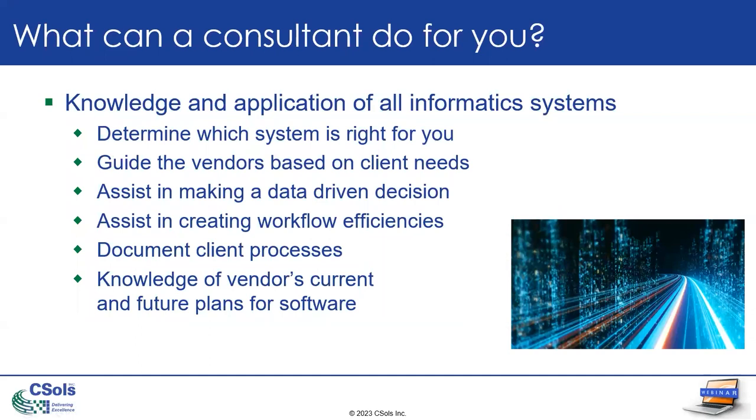So, what can a consultant do for you? Well, consultants have a lot of experience with many different types of laboratory systems, LIMS, etc. The important thing is to find a consultant that's LIMS agnostic, meaning that they don't have a vested interest in any one LIMS, but they have good relationships with all of the vendors. And they'll help you determine the system that's right based upon your requirements.